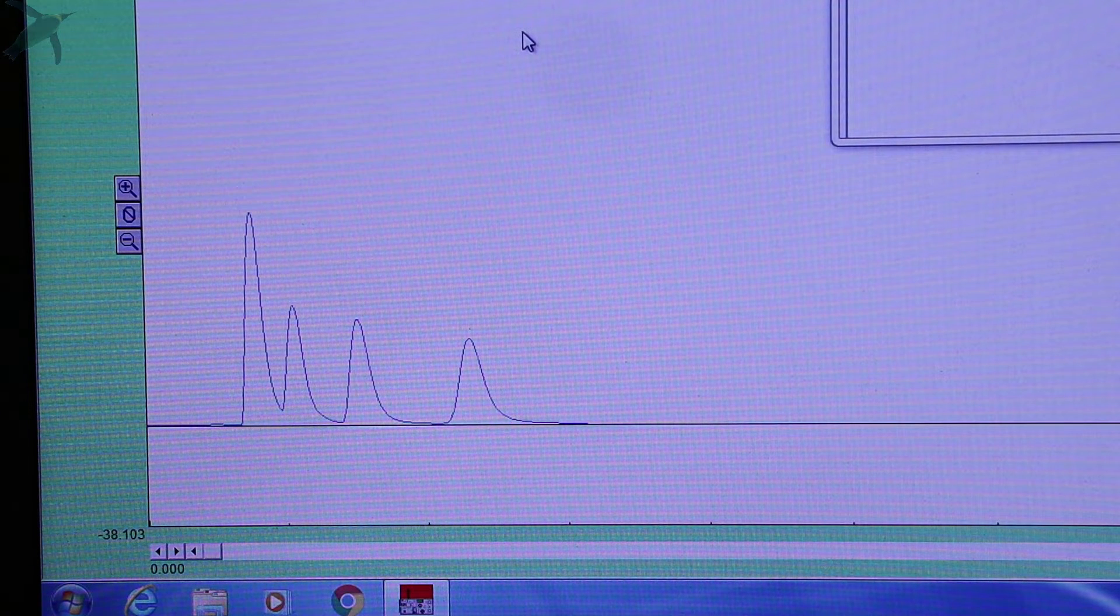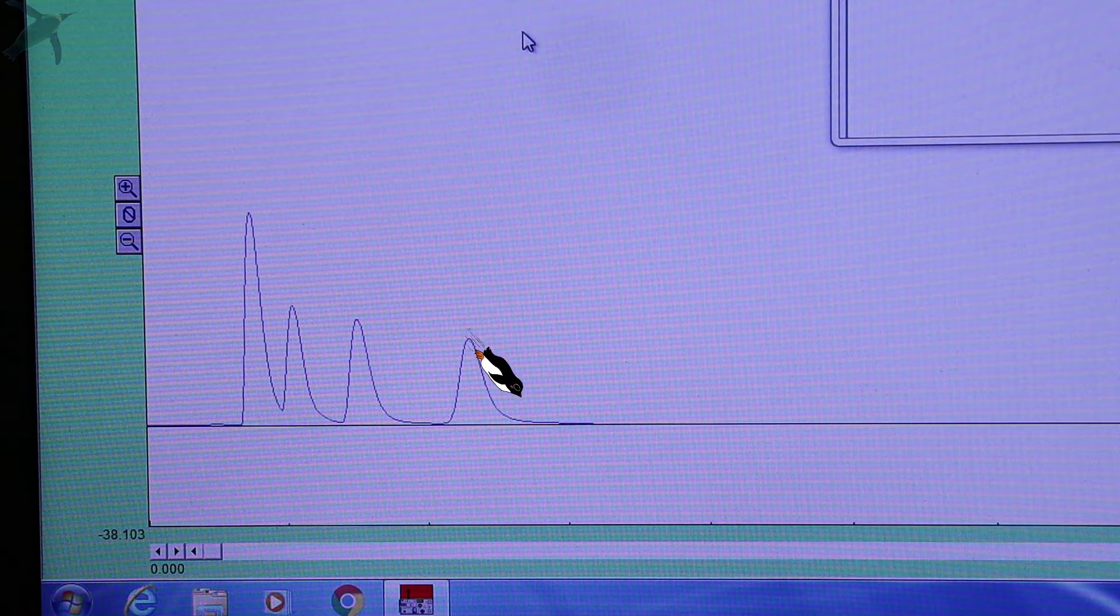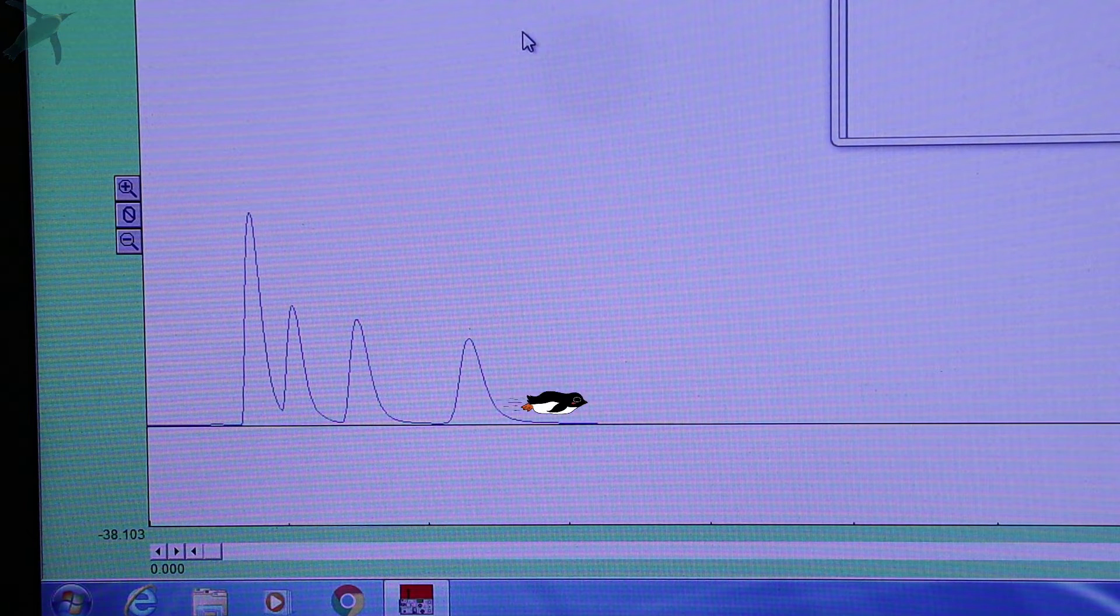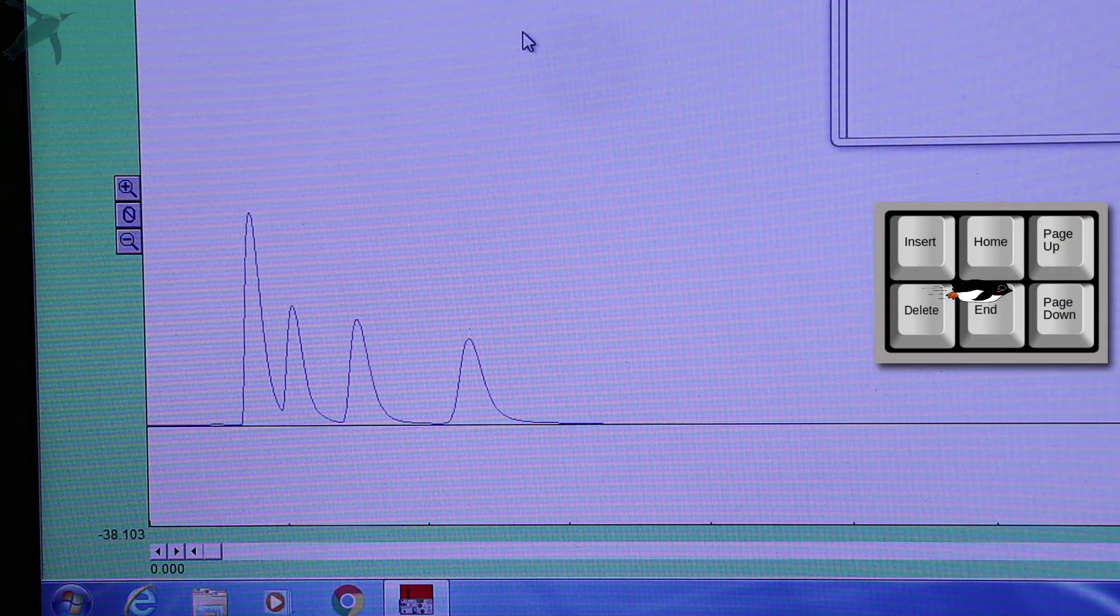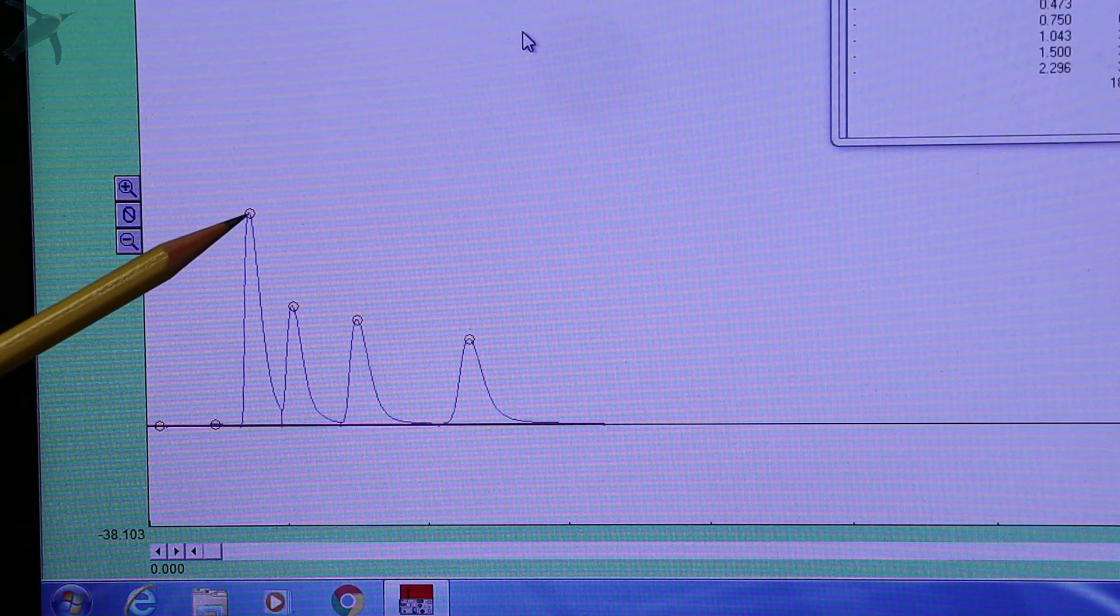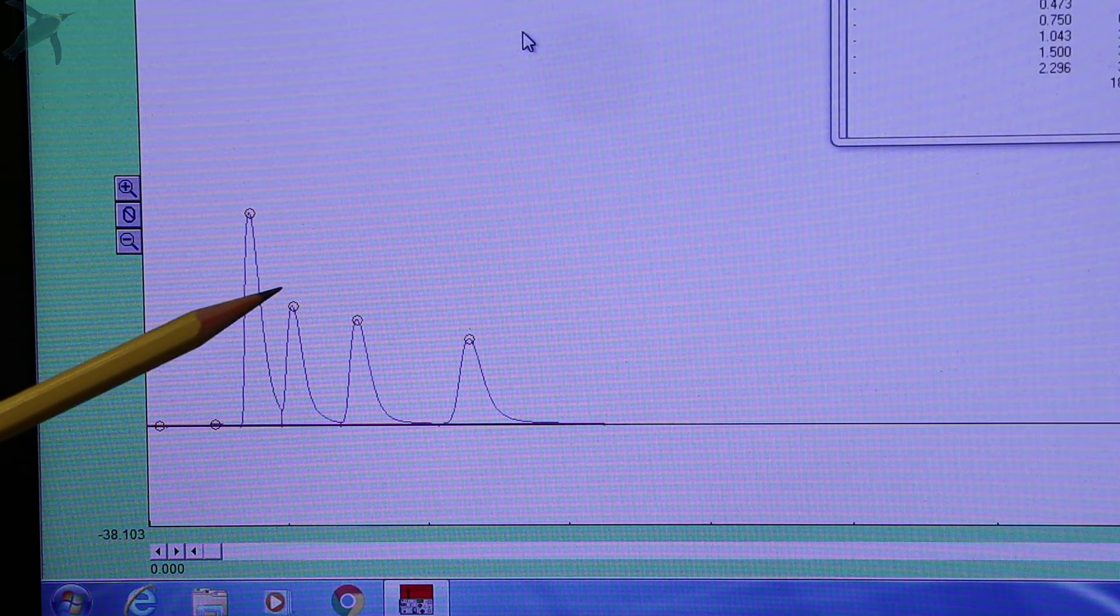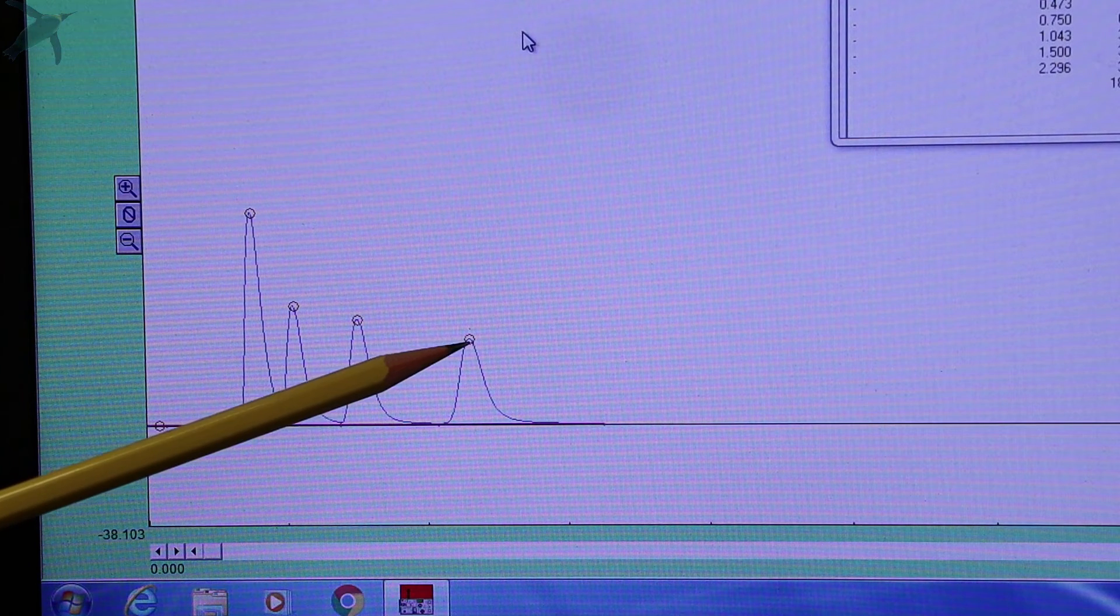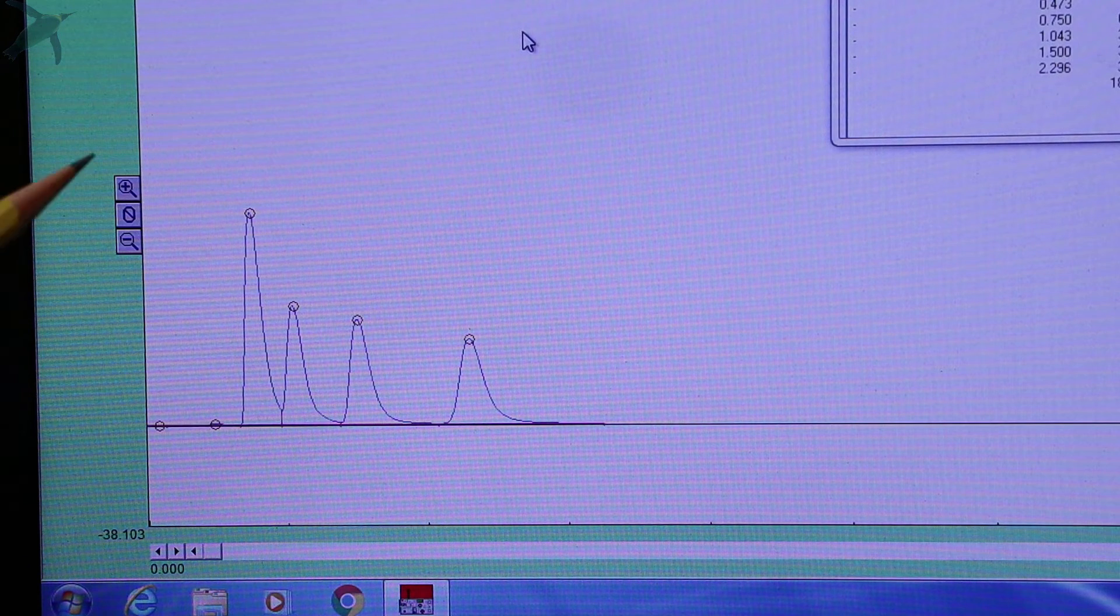So our analysis is now complete. We see four peaks, and to stop it we press End on the keyboard. You see that the peaks actually get a red circle meaning that they have been recorded and detected by the software.